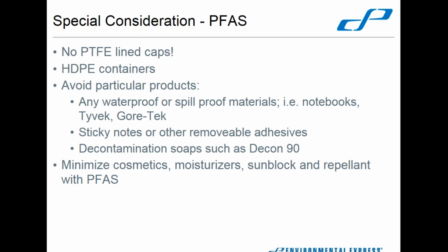When you're doing your sampling, you actually are instructed to avoid particular types of products being used in the sampling or by the samplers. Any waterproof or spill-proof materials, field notebooks, your Tyvek suits or your Gore-Tex suits, those are both brand names. Those are all treated with fluoropolymer type coatings to make them waterproof or spill-proof.